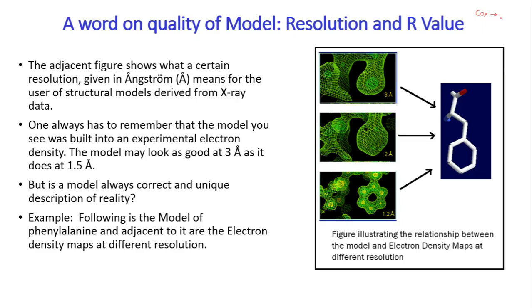You know, the cyclooxygenases are involved in inflammatory response, anti-inflammatory response. Okay, so now you might be interested in finding out the structure, or how many structures of these cyclooxygenase enzymes are available in PDB. What is it that we know about the structure of this enzyme? That structural information is present in your PDB database.